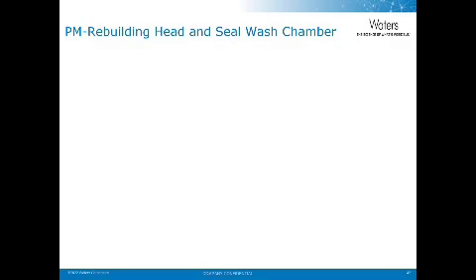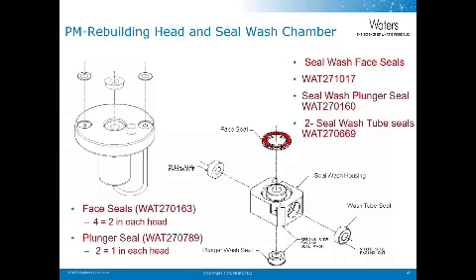Here we have exploded views of the head and seal wash chamber. When PMing both of these components, be careful not to damage the pump heads when removing or replacing the seals. The high-pressure plunger seal and seal wash seal look similar, so make sure to always verify the part numbers.